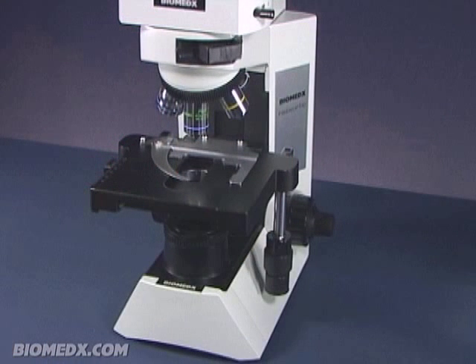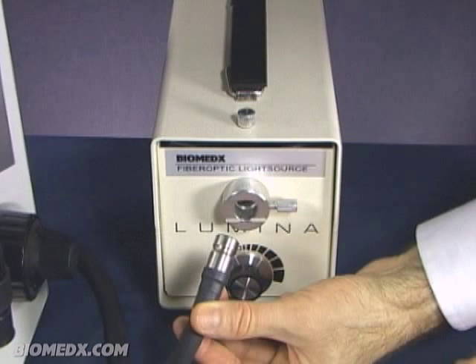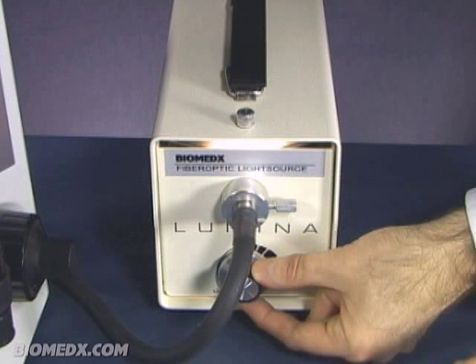Here is the base frame of the microscope. You will note that there is a fiber optic cable extending out from the back of the unit. This is the cable which will need to be connected to the 150 watt quartz halogen light source. It is with this unit and the power switch where you control the microscope light intensity.